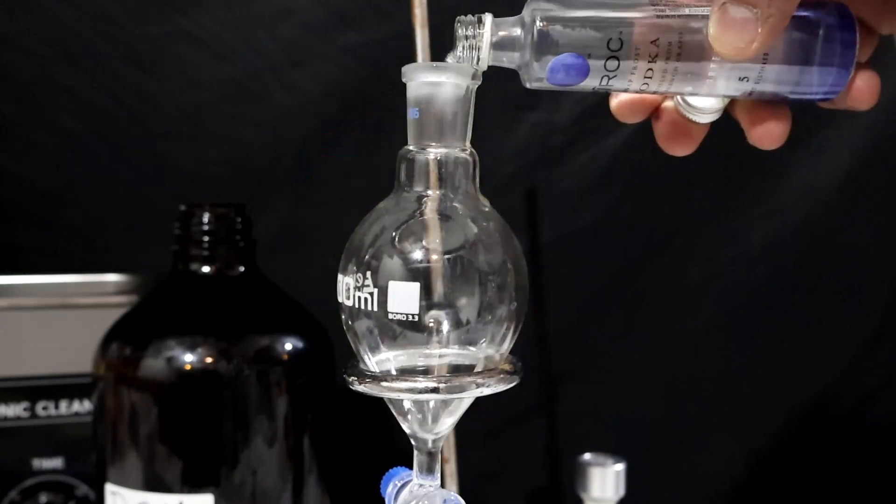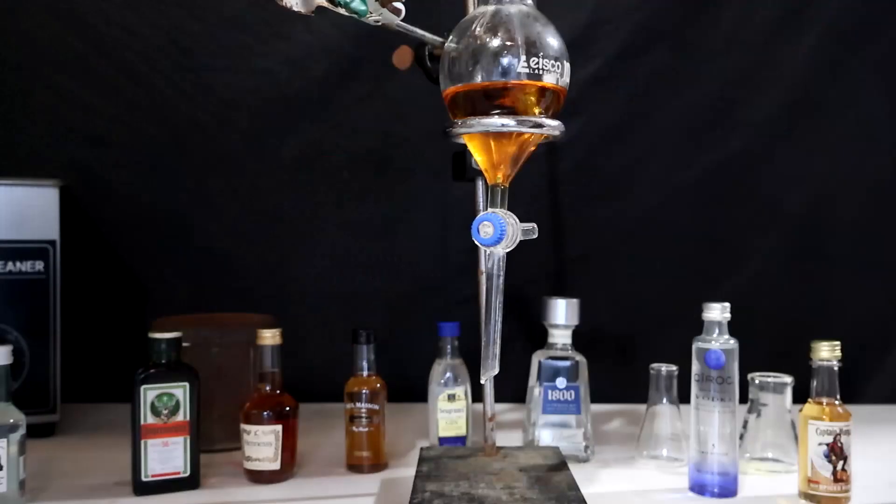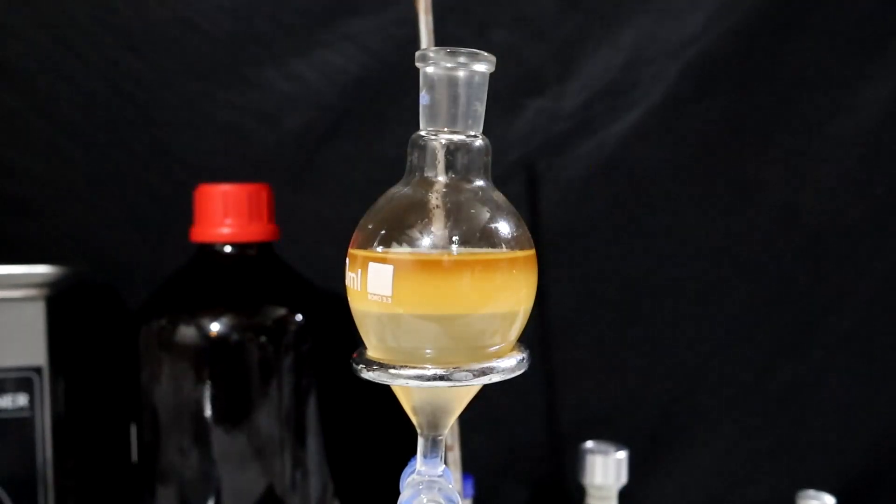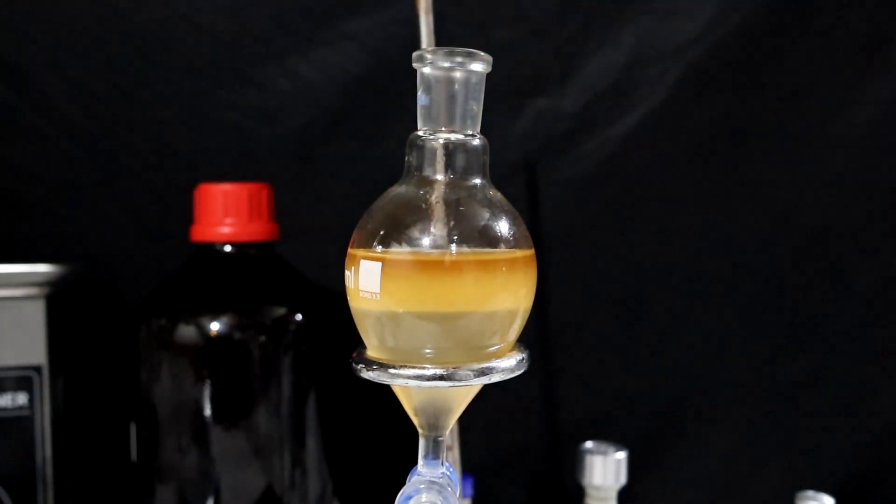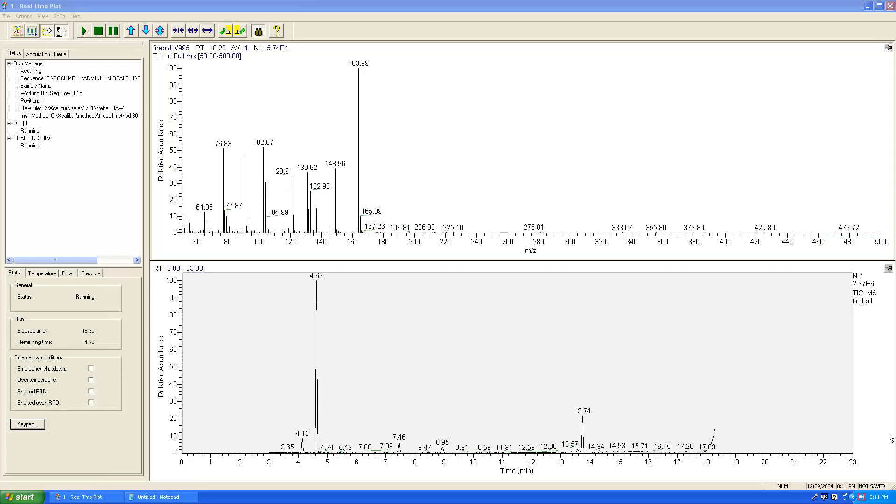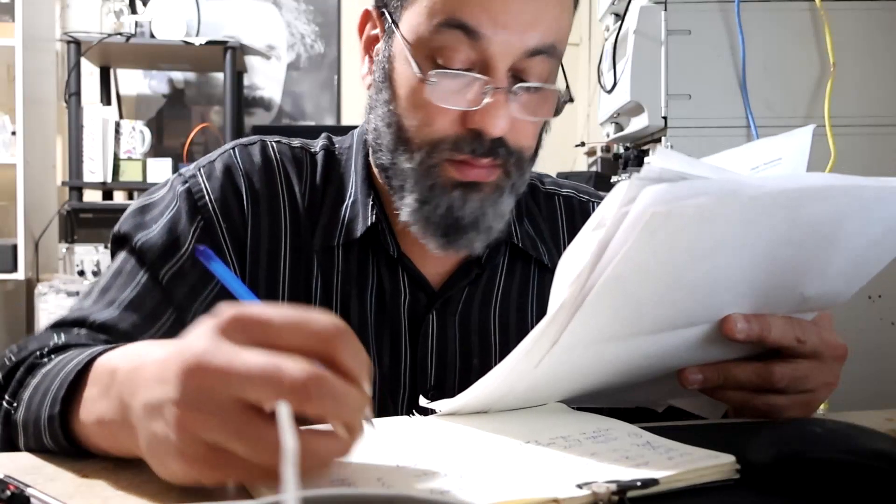These were all prepared the same way. I measured 50 milliliters of liquor and added 50 milliliters of DCM in a separatory funnel to extract most organics in those two phases. The top one is the aqueous phase we can discard, and the bottom layer is the one of interest to analyze.